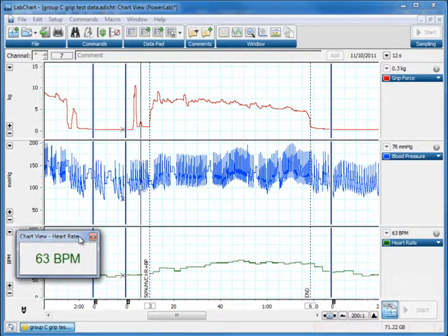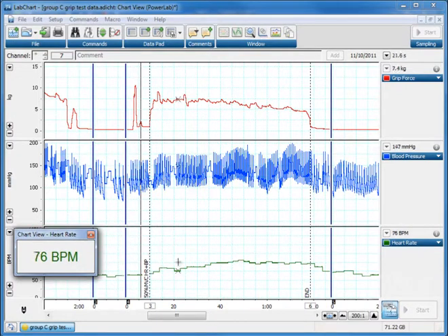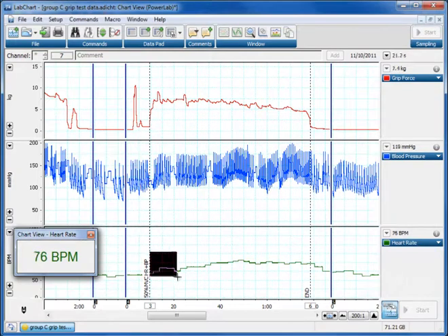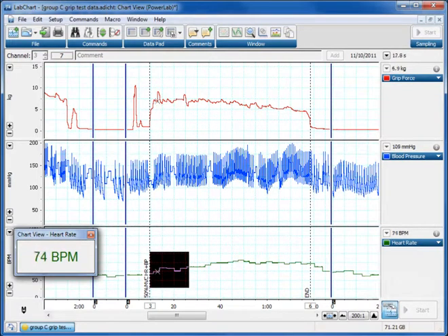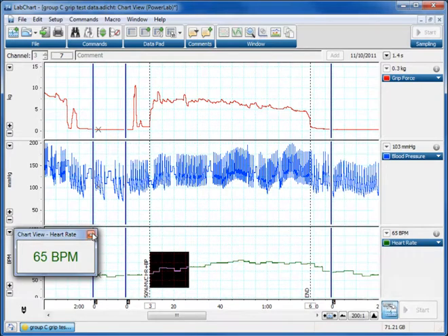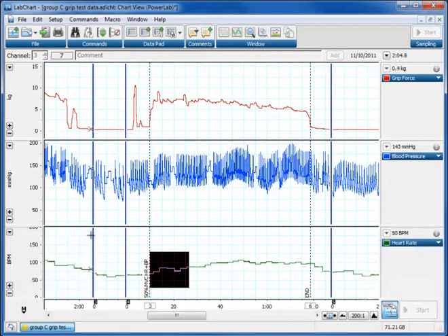Sometimes it's nice to be able to select an area and work out what the mean is. So we can select this area here, and of course we can't work out what the mean is because our numbers are changing as our cursor moves. So that's a DVM, it's very useful but limited for doing analysis.